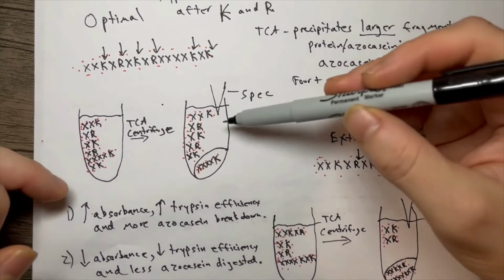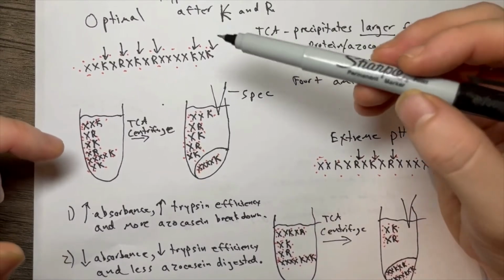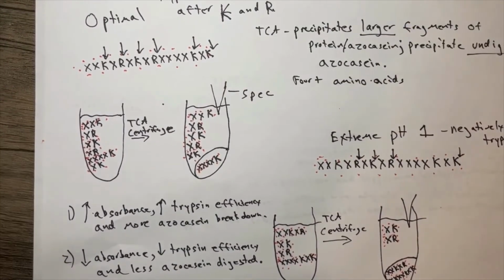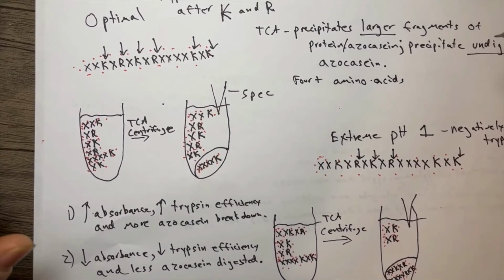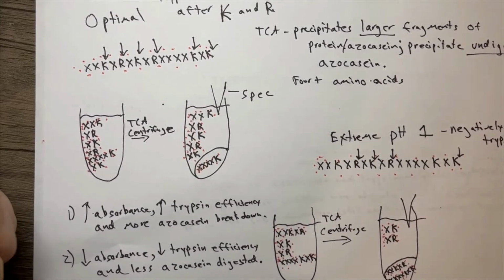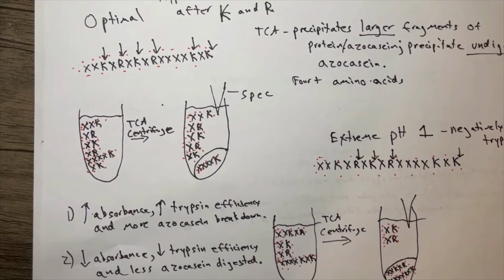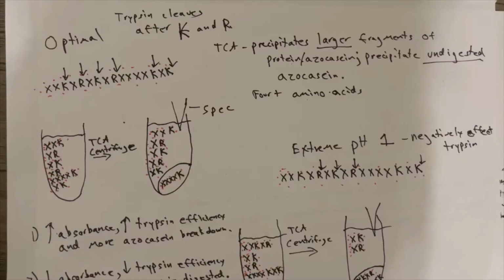It would just depend on the reaction conditions. If it was at a temperature and or pH well outside of azocasein's optimal conditions, then it would be possible that azocasein could denature into more of a linear, or unfolded form, away from its 3D conformation.